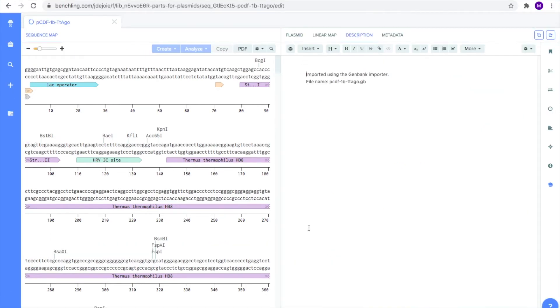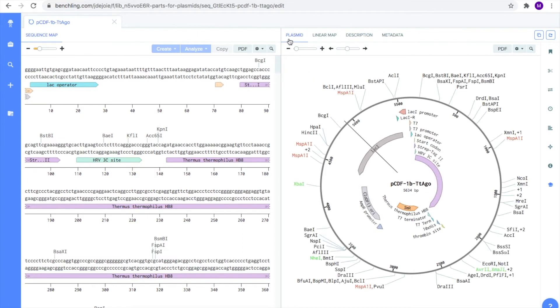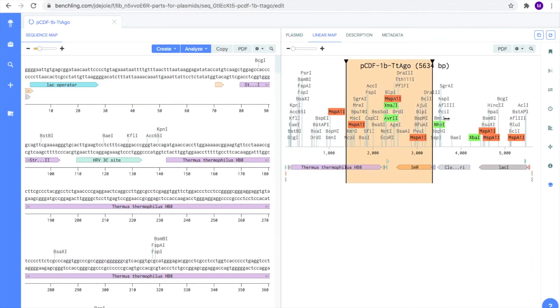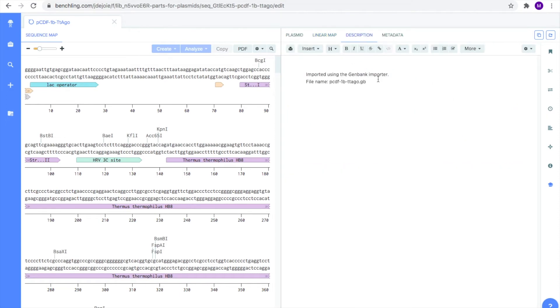Towards the top of the screen, there are four subtabs: Sequence map, plasmid, linear map, and description. The sequence map shows you the base pairs associated with each gene or annotation. The plasmid tab shows you the circular representation of the DNA sequence. The linear map provides you a linear view instead of a circular one of the DNA sequence. And the description tab serves as a digital notebook where you can take notes.